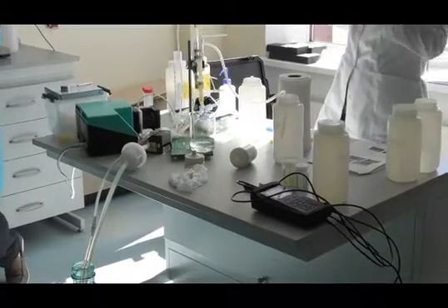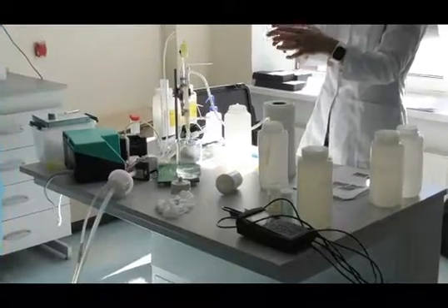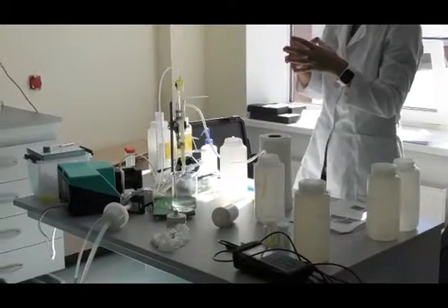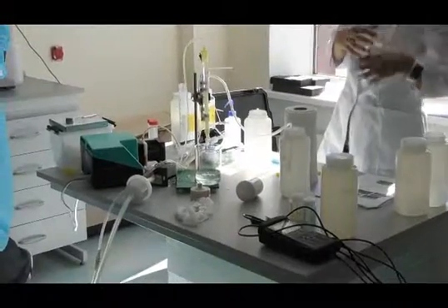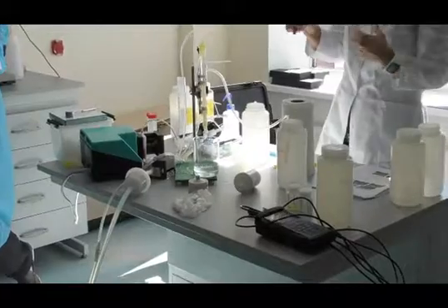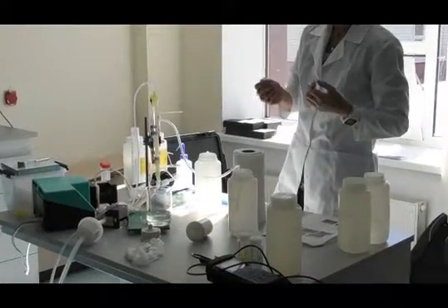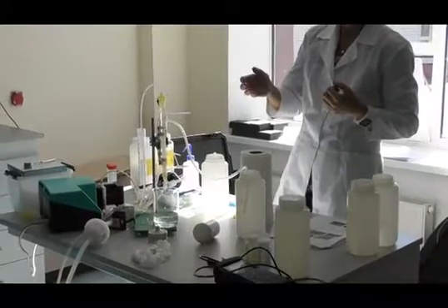So the anions in the sample will stick to the resin, because the resin has a surface filled up with chloride, and the chloride will be released and some other anions will get stuck to the resin. And then we will have chloride in the sample, but that doesn't matter to us. Stable chloride. So what's stuck in the column is the anions in the sample.